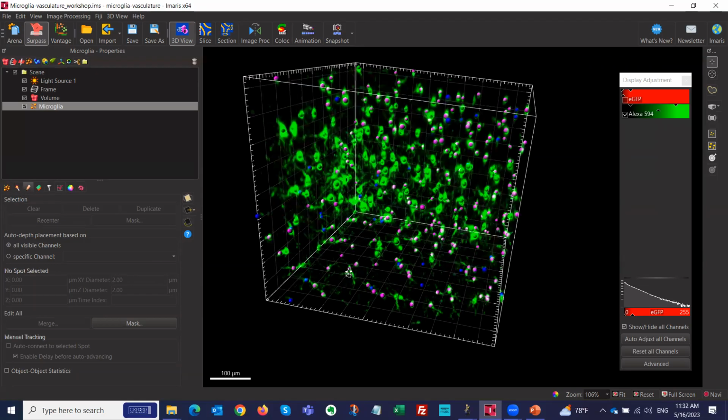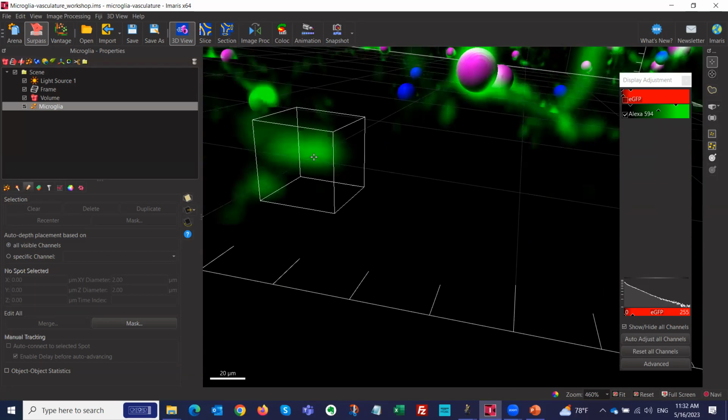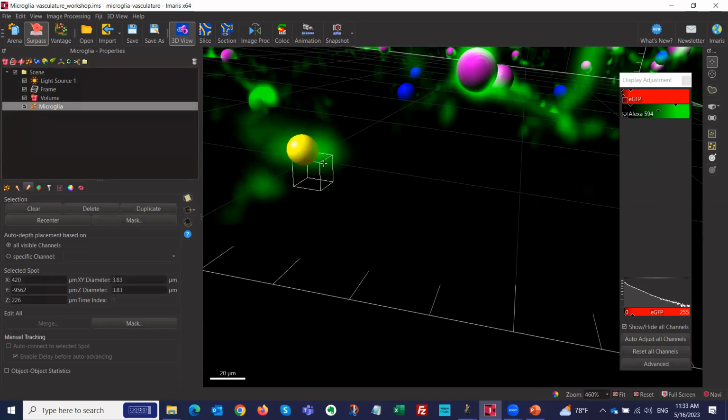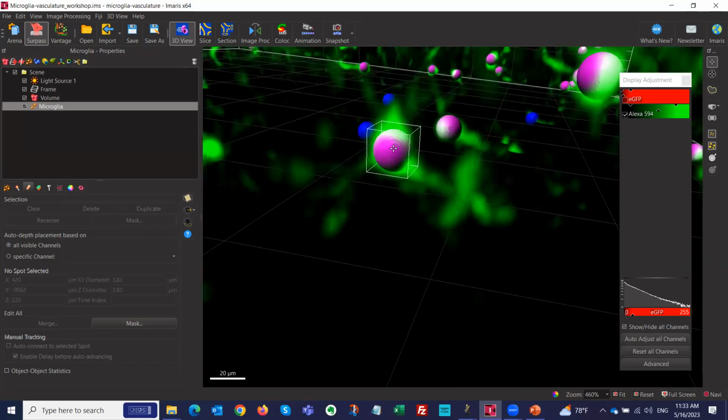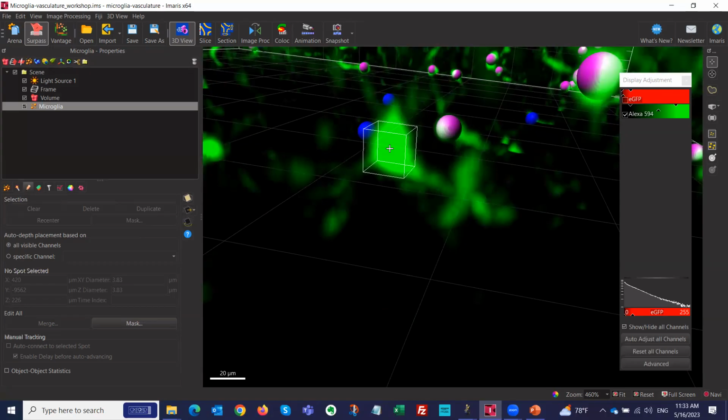So here in this edit tab, I can go in and zoom in and you see this little speckle here. I can use control mouse wheel to change the size and then shift left click to add a spot. Or I can remove spots like this guy. I mean, it's clearly a microglia, but I can remove spots as well. And then Control Z, just undo. Undo is everything you've done. So it brings the spot back.